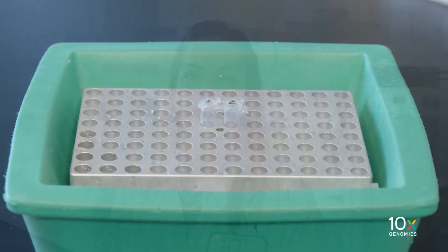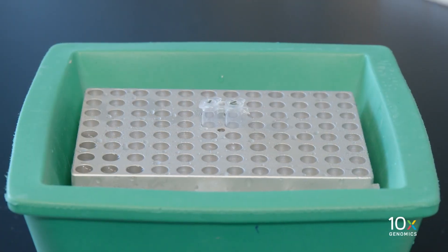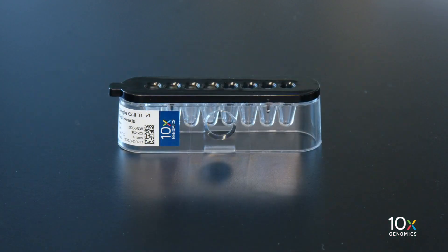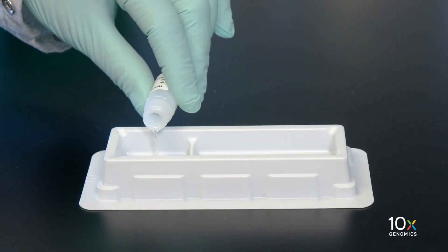We have added 50% glycerol to any unused wells. Now we will load the chip. We have our sample combined with our GEM master mix on ice. We also have our gel beads, which have been equilibrated to room temperature for at least 30 minutes, and we have our partitioning oil.